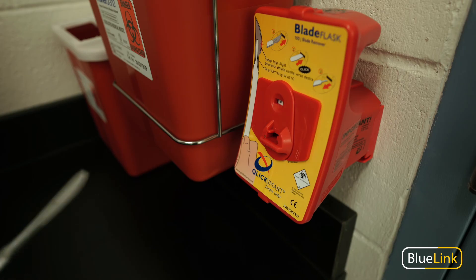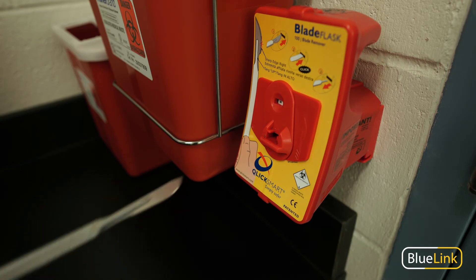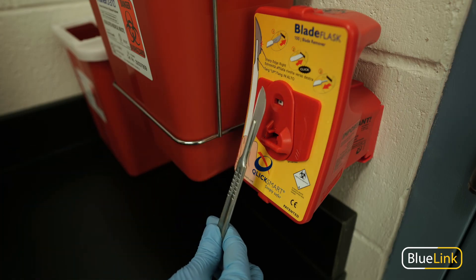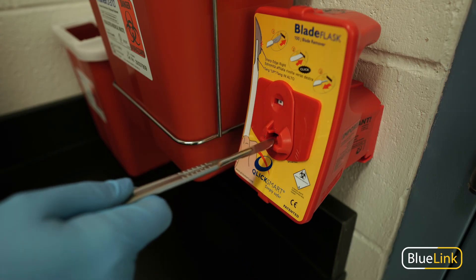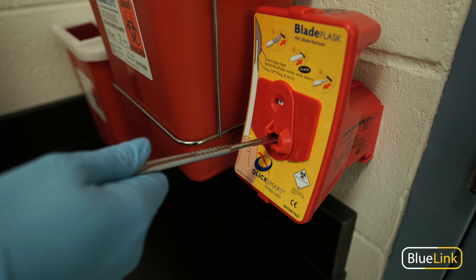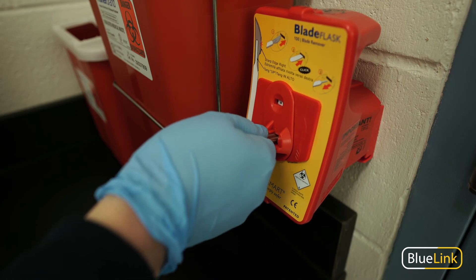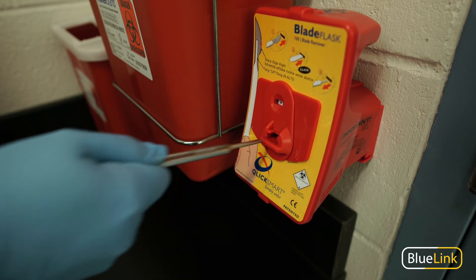After dissection, when you're ready to remove the blade from your handle, we'll use one of these blade removers. And you can follow the instructions shown here, but the blade should always be pointing right. You're going to simply and firmly insert the handle and blade all the way in until you hear a click and pull straight back out.